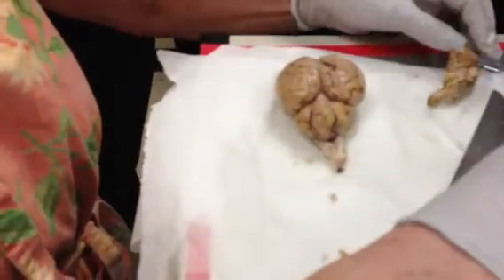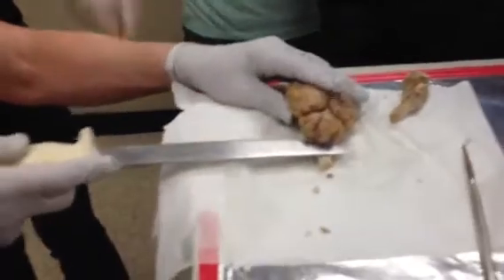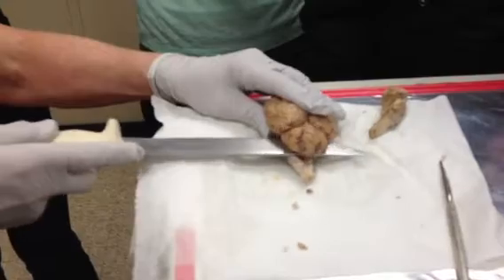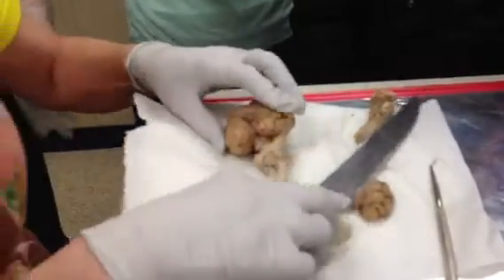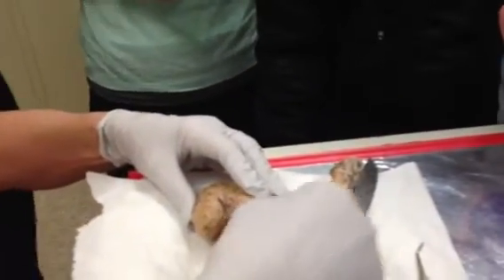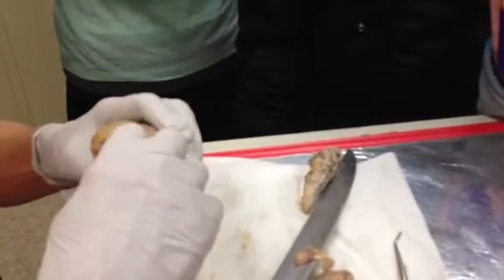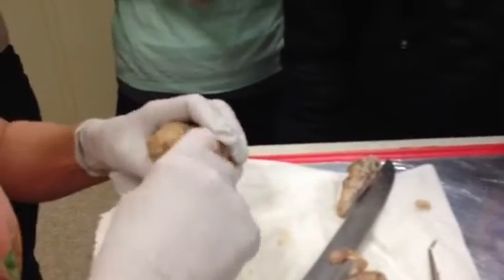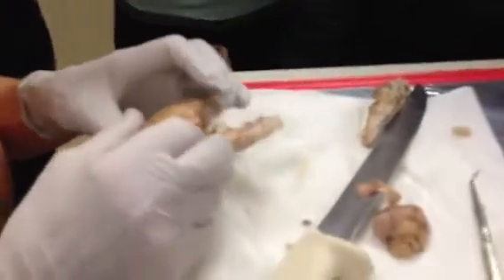Now, I'm going to actually make one. What I'm going to do is I'm going to tease off or cut off, I just took off the cerebellum. Okay, can you see the cerebellar peduncles here?